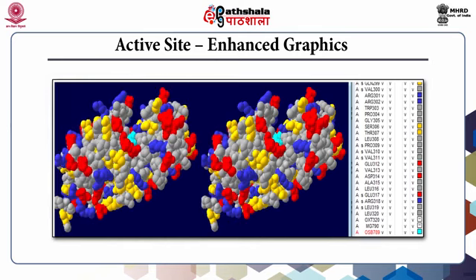To appreciate binding of substrate on the whole enzyme, display all the residues as spheres for both the backbone and side chains, with the color type set as type color, that is residue type. Set the substrate color as cyan color. Now center the molecule display. Rotate the molecule to view and to find out the cyan colored substrate.